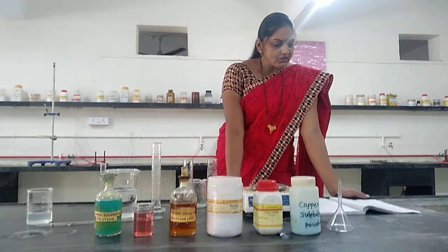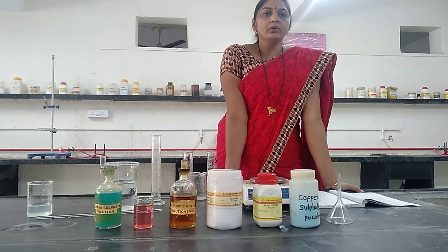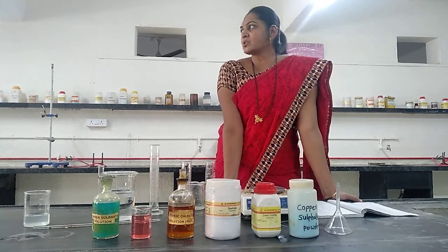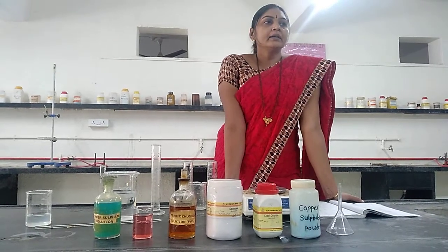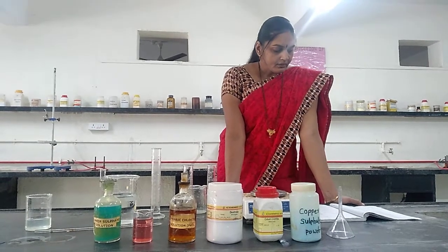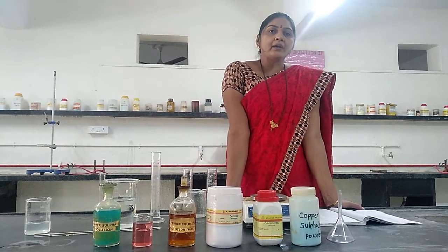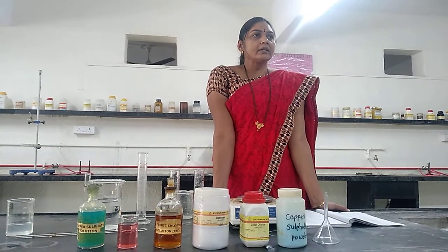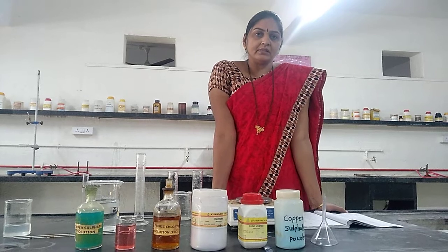Why is it essential to perform suitability test for dextrose? Give reasons. We have seen that dextrose is observed in two forms, dextrose monohydrate and dextrose anhydrous. When dextrose without electrolyte is administered, it causes pseudo agglutination of RBCs.